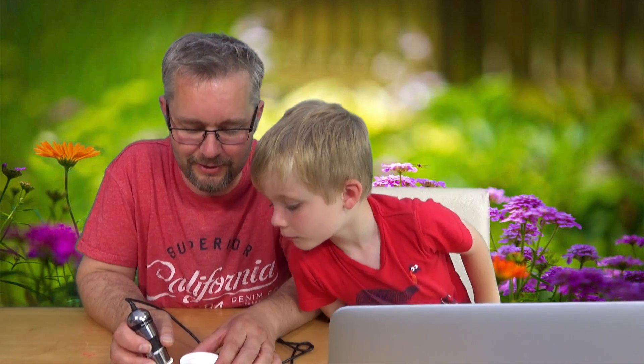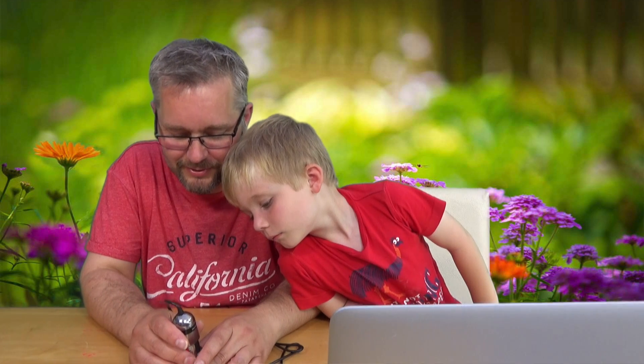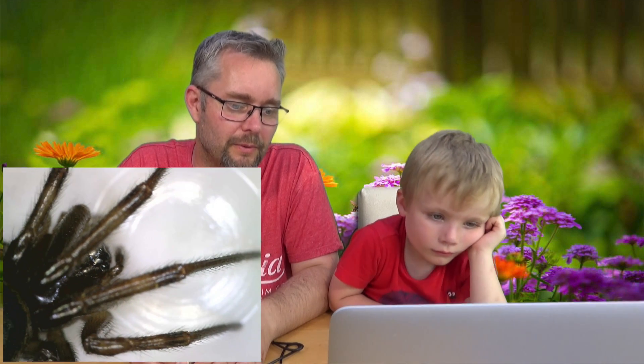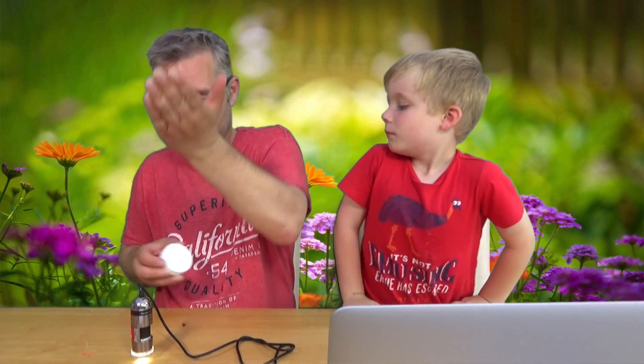If you don't like spiders and you're scared of spiders — we saw a live spider running around in our conservatory, so we thought we'd see if we could see it. If you don't like spiders, look away now. This is a real life spider — look at all those tiny little hairs on its legs. I just put a piece of paper down and it ran on top of it. You wouldn't think it's so hairy, would you? Little legs. There's this furry body — look! It's running around. I think that's enough. Should we let the spider go? There he goes — it's run off.